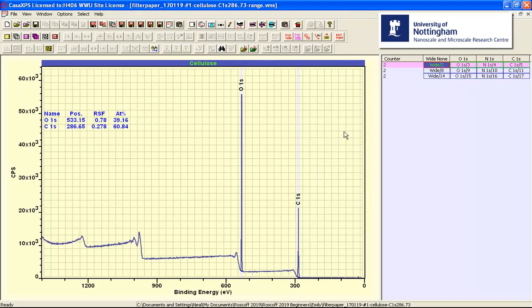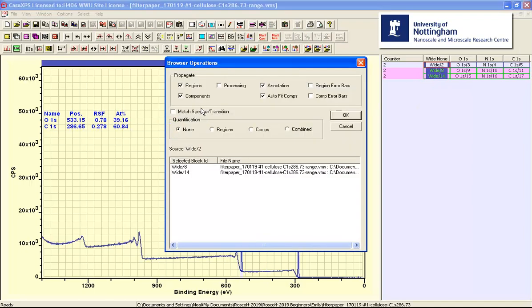And similarly for the survey spectrum. In this case we only have regions, but nevertheless we can use the same set of options because there are no components, none will be transferred and they won't be fitted. So we've got regions and annotation.